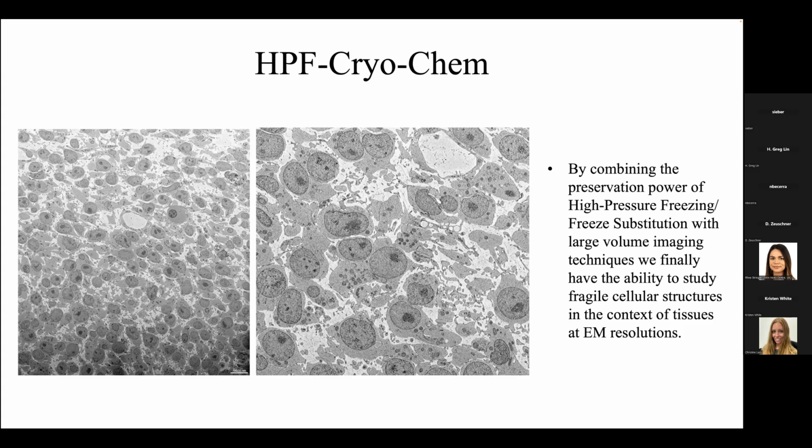So it's kind of like, let's just go collect a bunch of tomograms and see what we see. We should be educating folks that we should take a step back and get these very informative large volume views to then pinpoint where we need to go and what we really want to study as we move forward with cryo-electron tomography. So hopefully, high pressure freezing will be that plug-in between the single particle SPA work and the cryotomography, molecular tomography work.